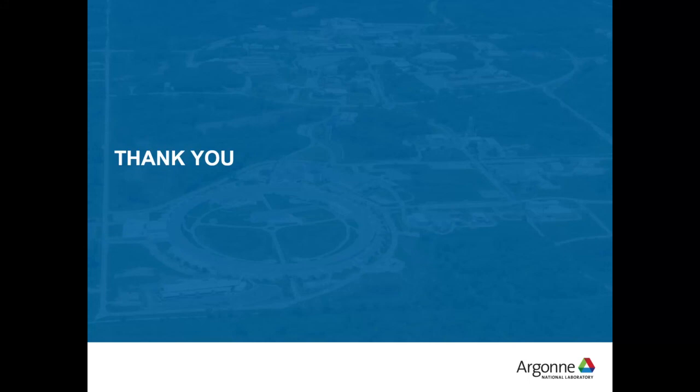Questions? For the charge flipping block, does it automatically plot those phases? There's actually a place in the GUI where you could pick HKL and select your reflections. There's a default set of reflections which are just there. Maybe not appropriate in all cases, but they're there. And so you can actually see it if you wish.